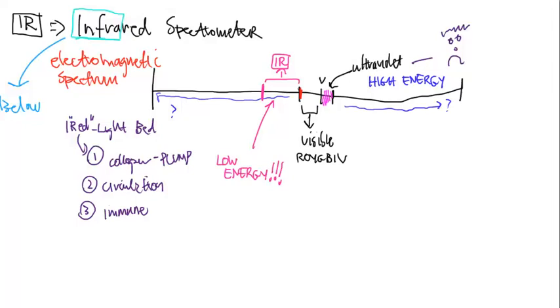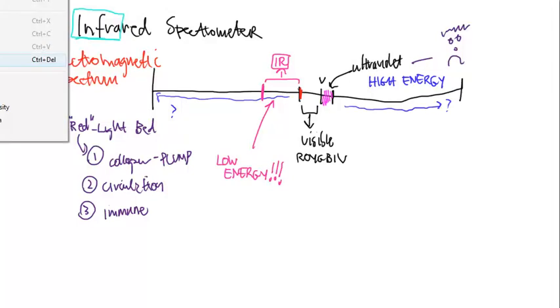All right, so I think that I need to give you a very quick review on wavelength. Now, this is something that we talked about in the UV Viz section, and it's something that's going to continue to creep up more and more every time we talk about a new instrument. So, in the previous videos with the UV Viz module, we talked about wavelength. And we said that wavelength is basically the distance between two peaks of a wave.